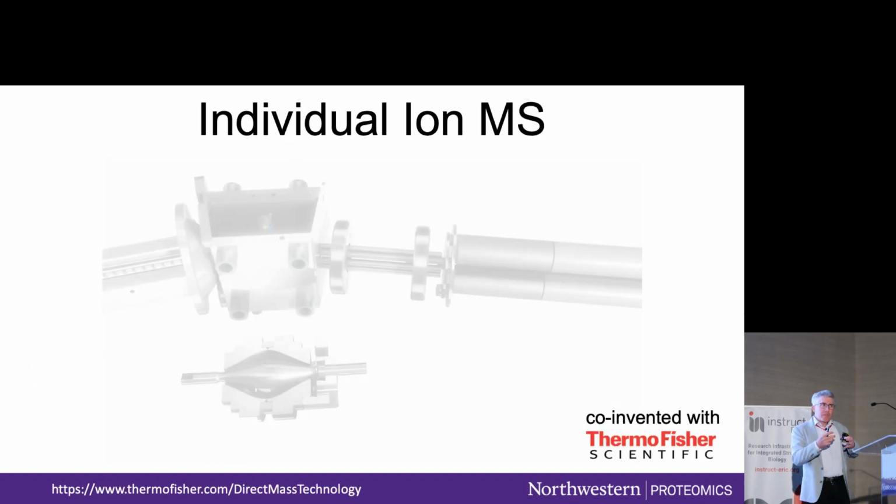So now the basis of signal is a single ion itself. You no longer need constructive interference. And that has a huge effect. So here's 4 ions undergoing the process. Here's 4 ions, different slopes, and spinning at 4 different frequencies.